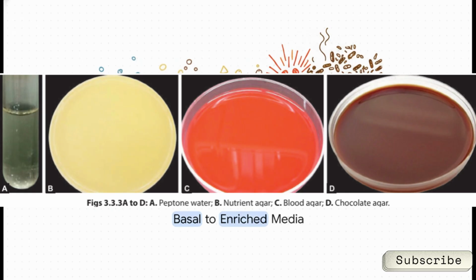All right, let's look at the progression from simple to complex. On the left, you start with clear liquid peptone water or a basic yellow nutrient agar. But to grow those picky, fastidious bugs we talked about, you gotta upgrade. Add sheep's blood, and boom, you get blood agar. Now, if you take that blood agar and heat it to 70 degrees Celsius, the red blood cells lyse and release even more nutrients. That gives you this rich brown chocolate agar, which is the absolute favorite for fastidious bugs like Haemophilus influenzae that won't even grow on your standard blood agar.